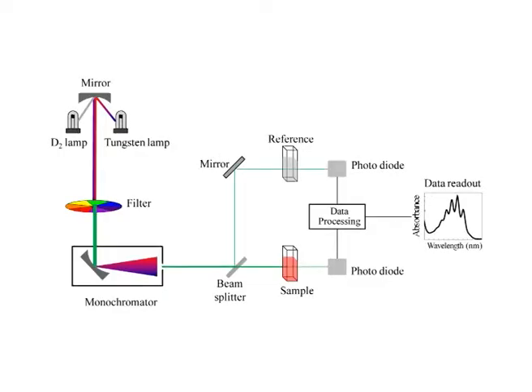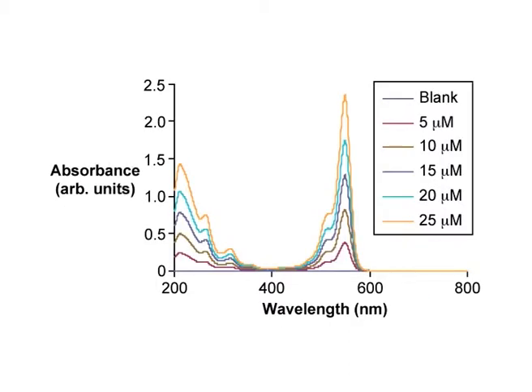As we have studied, the spectrometer operates by comparing the amount of light in the beam transmitted through the sample with the reference beam which passes through the reference cell. In this way, the spectrometer measures the amount of light absorbed by the compound at each wavelength. This absorption gets recorded on the chart paper as a plot of wavelength of the entire region versus absorbance. The various kinds of spectrophotometers are described below.